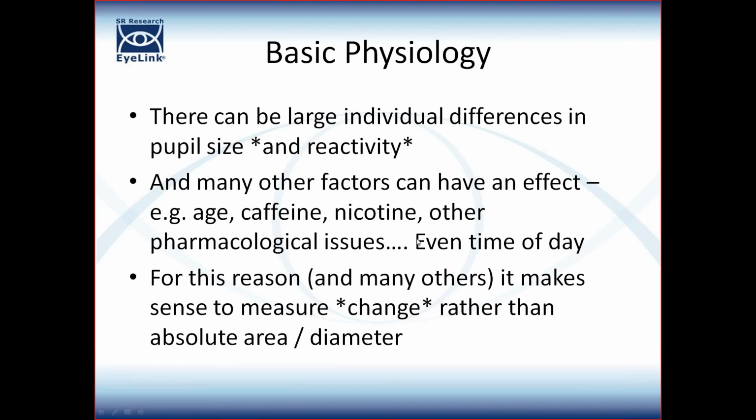Even, I think, time of day, so when you do your testing. Again, the implications being you should probably at least attempt to control for these things. But the key point I want to make is that within an experiment, it makes sense to measure change rather than some kind of absolute area.